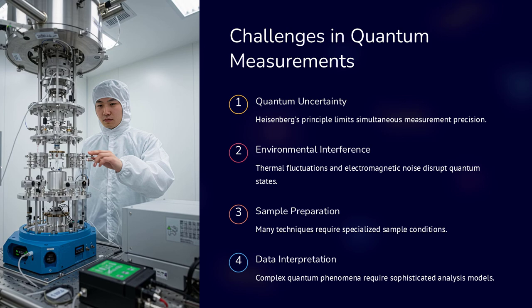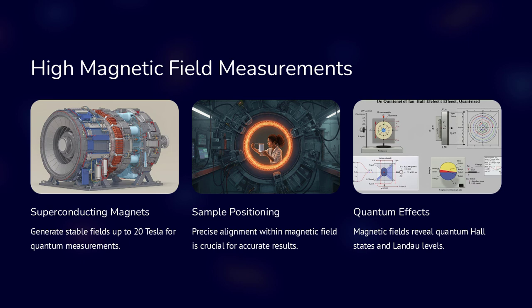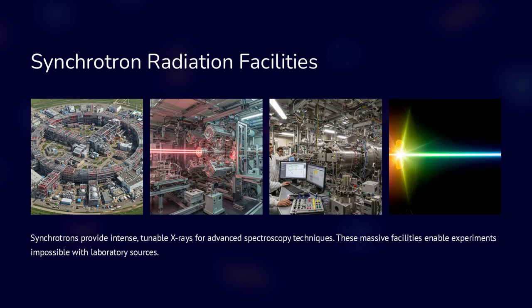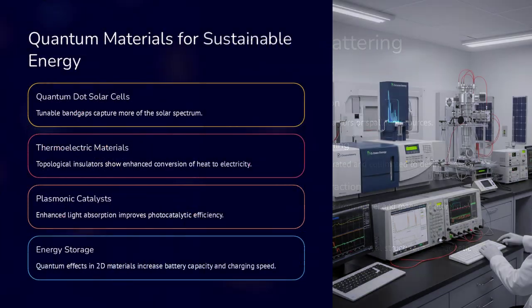Raman spectroscopy can provide vibrational fingerprints that are sensitive to the nanoscale structure and any surface modifications of quantum dots or plasmonic particles. Pump-probe spectroscopy, which uses two ultrafast laser pulses, allows scientists to study the dynamics of electron excitation and relaxation in these systems, offering insight into the transient quantum states. Each of these techniques plays a critical role in unraveling the complex quantum properties of these materials.